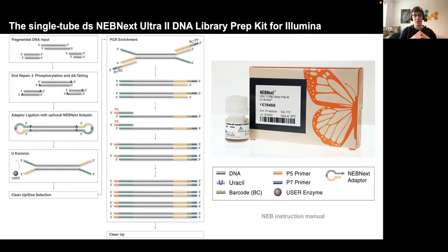And we need to keep them in there. We don't want to basically fragment our old DNA. And the other bit is that during indexing PCR, only one of the primers, in this case P7, has a barcode on it. And we want to keep both sides barcoded, especially since Illumina sequencing technologies are moving more and more towards HiSeq 4000 and NovaSeq. And these technologies have an additional PCR step where it's really important to have barcodes on both sides to make sure that you do not have barcode skipping and potentially cross-contamination in your final pool.